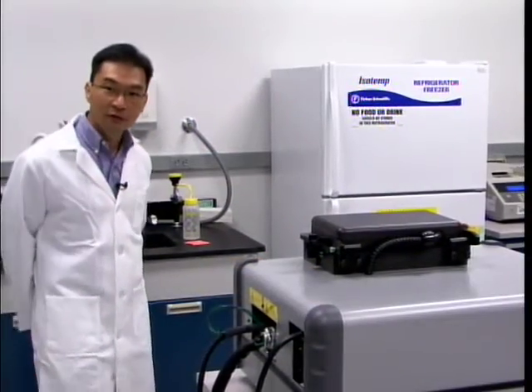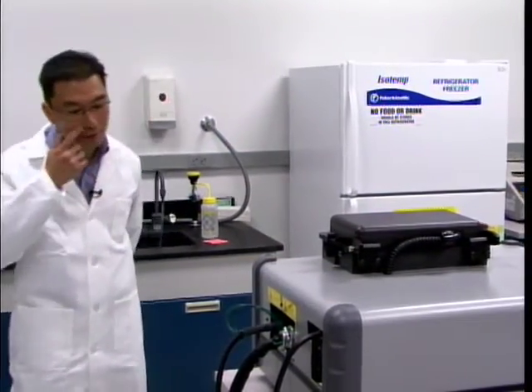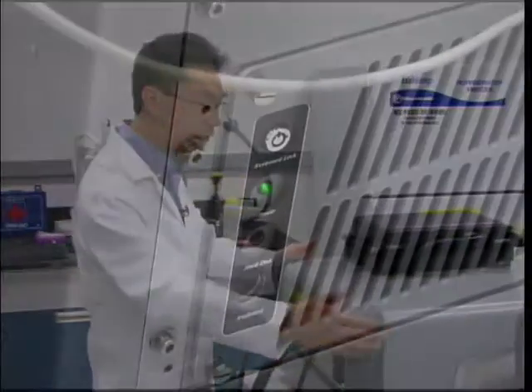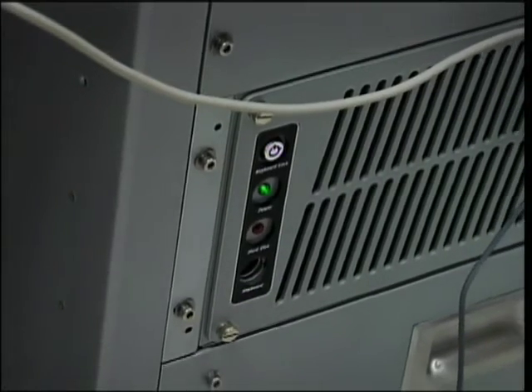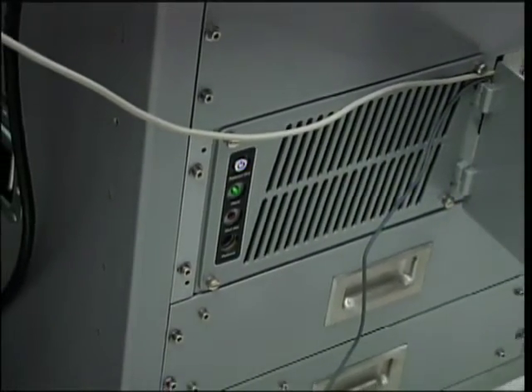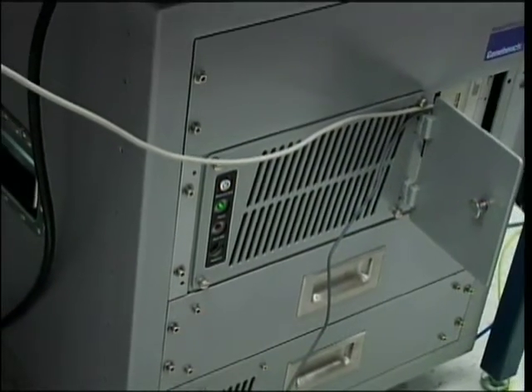Welcome to the demonstration portion of this workshop. What we have here is the GeneBench FX100, the separation and detection portion of the integrated DNA analysis tool. This instrument comes in two parts: the bottom unit, which is essentially the power supply and computers, and the top unit, which consists of the laser, the detectors, the optical train, and the chip holder from which separation and detection will take place.